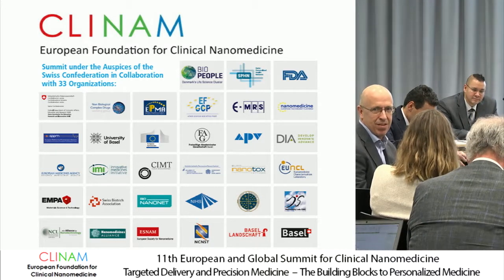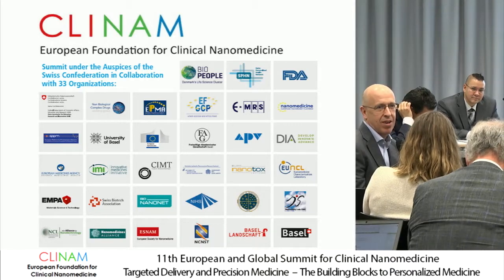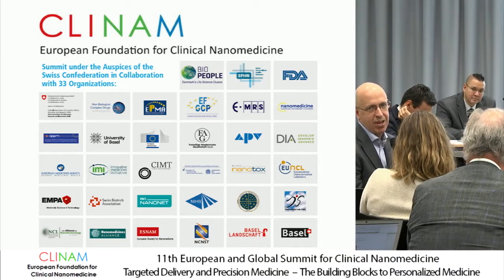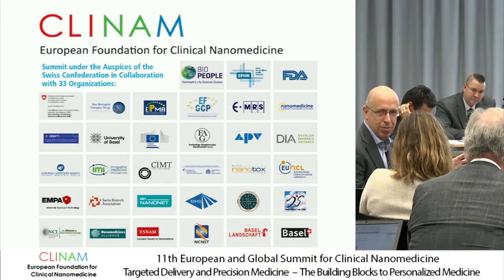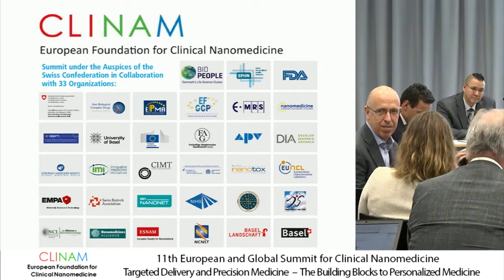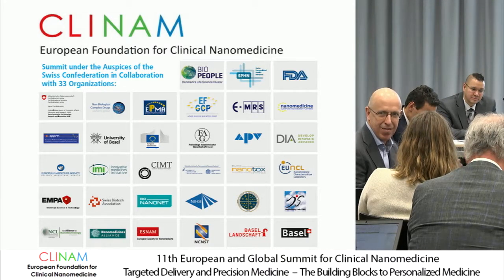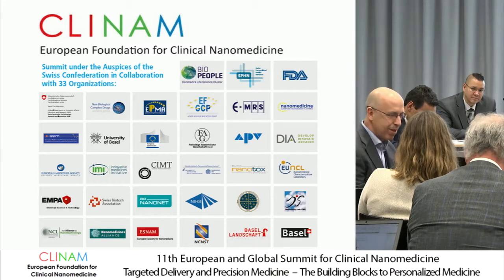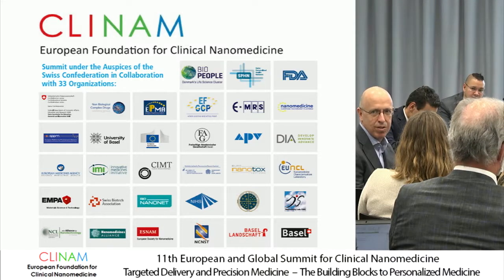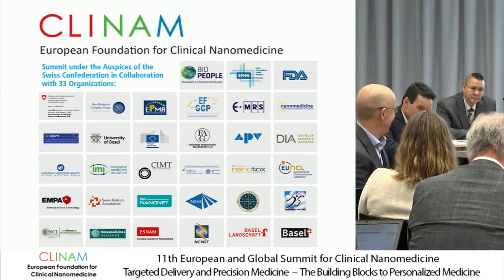Another point is that because you're working on, let's say, more industrial material, and I guess in the frame of the European regulation, in your case specifically you have to take into consideration the definition of a nanomaterial according to the European Commission, which doesn't apply directly in the case of nanomedicine. As you know, it's very tough, and you have to be able to measure the number size distribution of your particles in the 1 to 100 nanometer size range. But definitely it's interesting what you do.